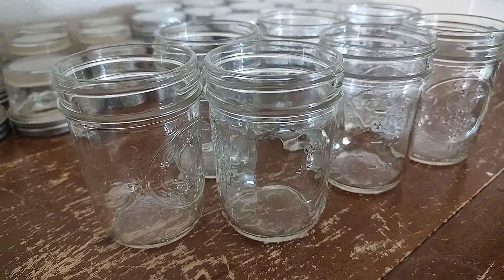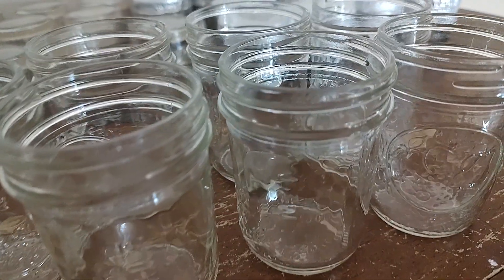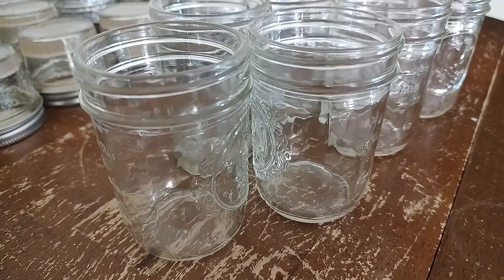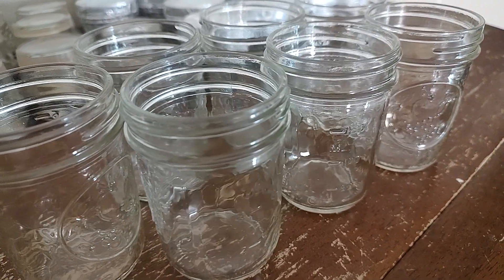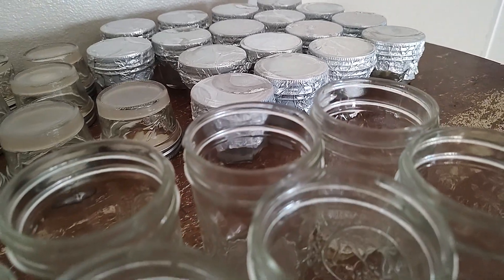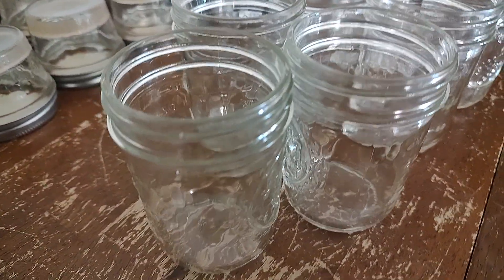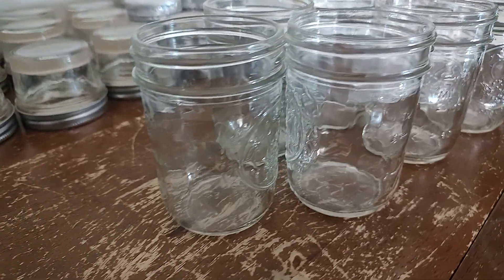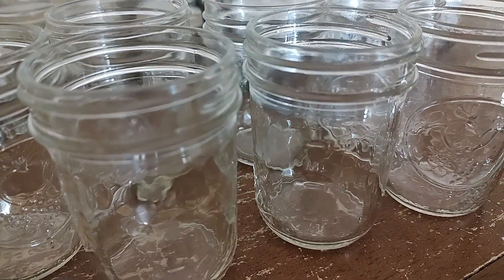Hello friends, I hope you're having a great day. I just wanted to pop in and remind you about pressure cooking. You can PC all of your jars, lids, and tools in between uses. The husband was reminding me of this yesterday — he created some MYA no-pour agar jars, and he pressure cooked and cleaned the liquid culture LC jars we use in the process. He says: when in doubt, pressure cook. He hand washes and scrubs everything in between uses and then also pops everything in the pressure cooker.